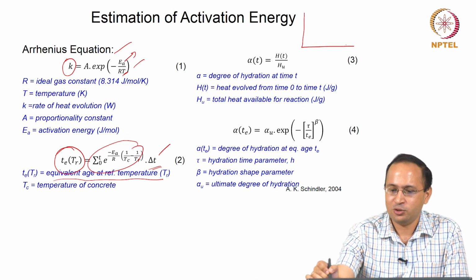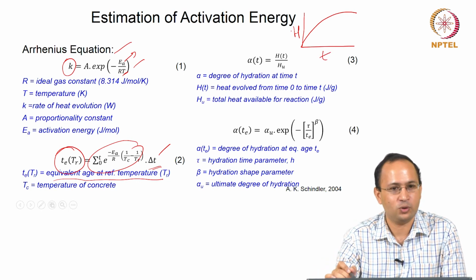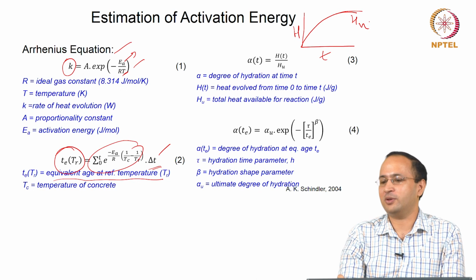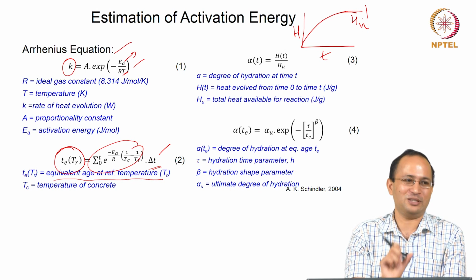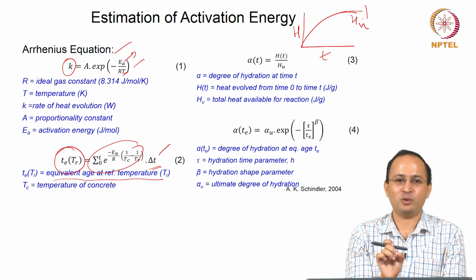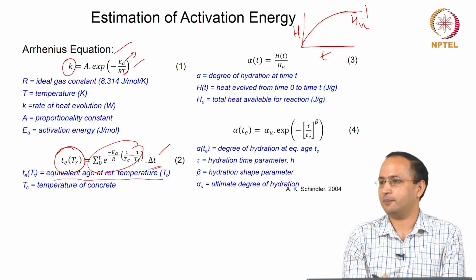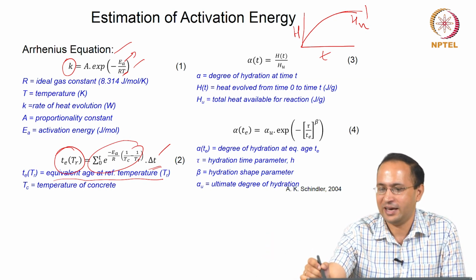So, this allows you to calculate that heat of hydration, because suppose you have this hydration curve, you have calculated the total heat with the time, right, and I know my final HU is the total heat available from the reaction, like when the reaction completes, or you can calculate it also from your composition, because suppose you start with the cement has phase composition, you know a pure phase releases so much of heat. So, you know the heat released by pure phases, you can calculate the total heat. Also you can extend this plot for an example, right, you can extend it and get the HU value.